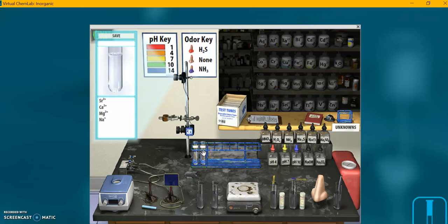Now this is the new one that came. This is our solution, the remaining solution, after the barium precipitate was taken out. Now I'm putting it back. So we know we've got barium in there.